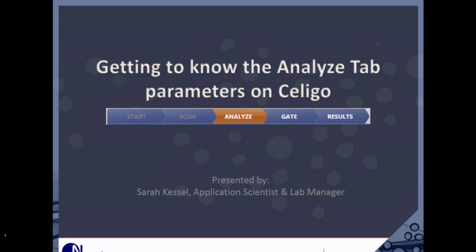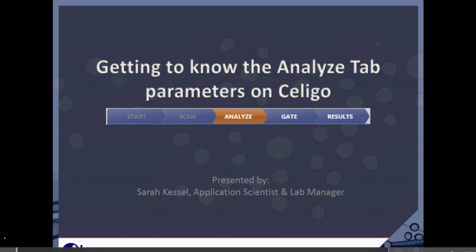If you're just learning how to work with the Celigo, the Analyze tab can be a little bit daunting because it's image analysis parameters. And so that's why we're holding this special webinar for this topic. It's something that'll help understand the details of how your image is actually being analyzed. So hopefully at the end of this, you'll have a little bit more clarity and understanding of how to set up the parameters in the Analyze tab.